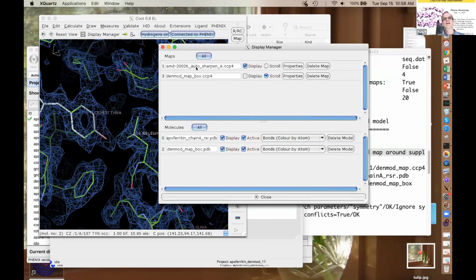But if you're from X-ray crystallography, you'll know that in X-ray crystallography, it is very dramatic. You can start off with a really bad map, build a little piece of model, and it gets things a little bit better. You iterate that process 20 times, and then suddenly you've got the whole thing. In cryo-EM, we have not achieved that. You can get a small improvement by iterating, but it's not dramatic. Say you built 60% in one shot, and maybe you build 65% after you do it a couple of times. That's the kind of improvement you're talking about.